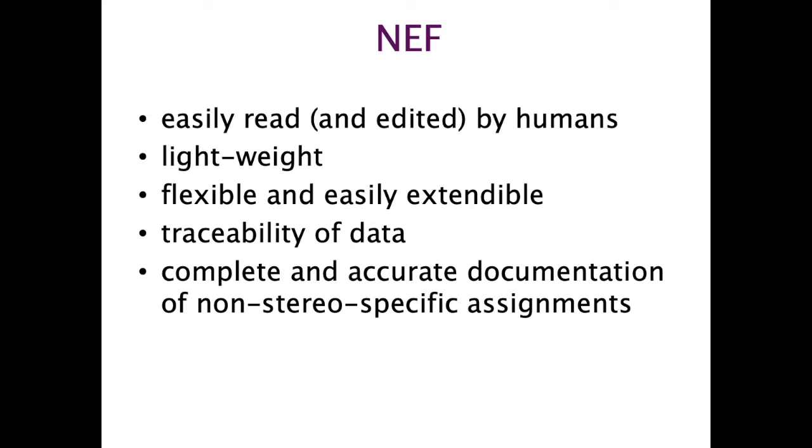The other important element about NEF is that finally it is a way of completely and accurately documenting non-stereospecific assignments. This really has been a big problem so far, that this information is not accurately deposited in any of the databases. Particularly if I have a structure that I've calculated in ARIA, ARIA will swap my non-stereospecific assignments to try out which one is the correct one, and that information about which chemical shift is associated with which atom is known to ARIA, but that information is not relayed anywhere else, to any structure validation programs, to any databases for deposition.